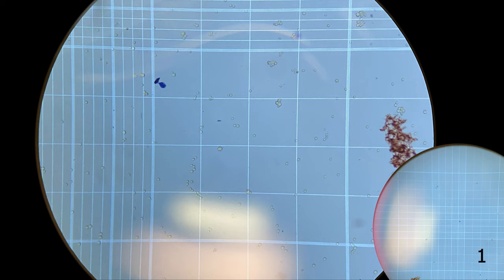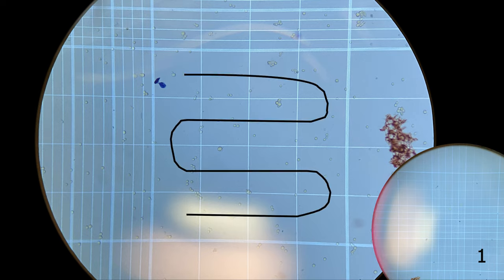To do that, we'll start in the top left-hand corner, moving back and forth, count the number of cells in each square, like this.